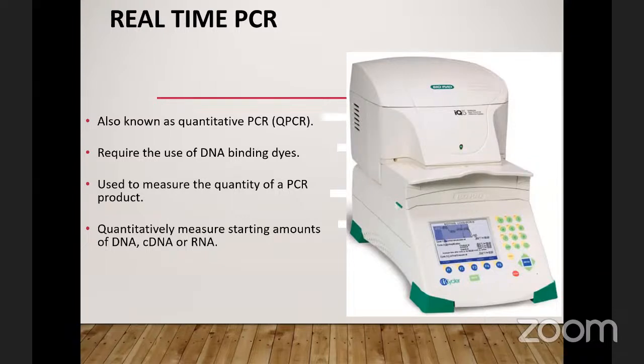It's also known as quantitative PCR, or the one we say qPCR, and it requires the use of DNA binding dyes. It's used to measure the quantity of a PCR product, and it quantitatively measures the starting amount of DNA, cDNA, or RNA in your sample. So with this real-time PCR, we can quantify. In our normal conventional PCR, it's just going to tell you, oh, this DNA of this so-and-so organism is present in this sample. This one is not present.